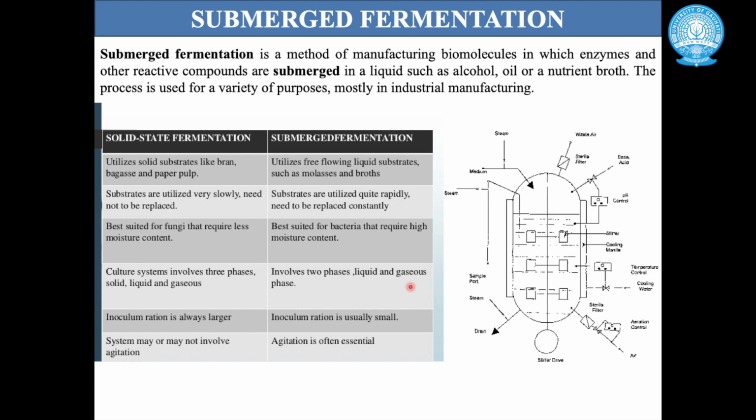Now we'll discuss something about the submerged fermentation. It's a method of manufacturing biomolecules in which enzymes and other reactive compounds are submerged in a liquid such as alcohol, oil, or a nutrient broth. The process is widely used for a variety of purposes, mostly in industrial manufacturing.